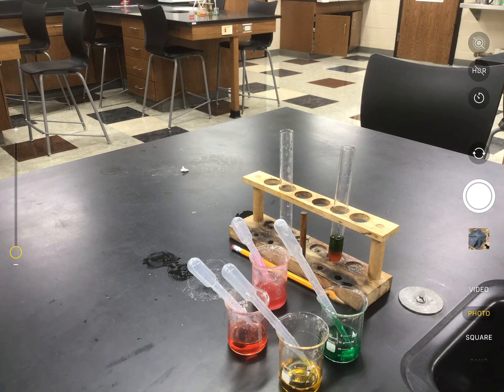So based on this information, you can use my test tube as an example, but when you draw it, it should be stripes. So the red should be on the bottom, the orange should be next, the yellow should be the third one, and then the green should be the last one. And then you can answer the questions after that.